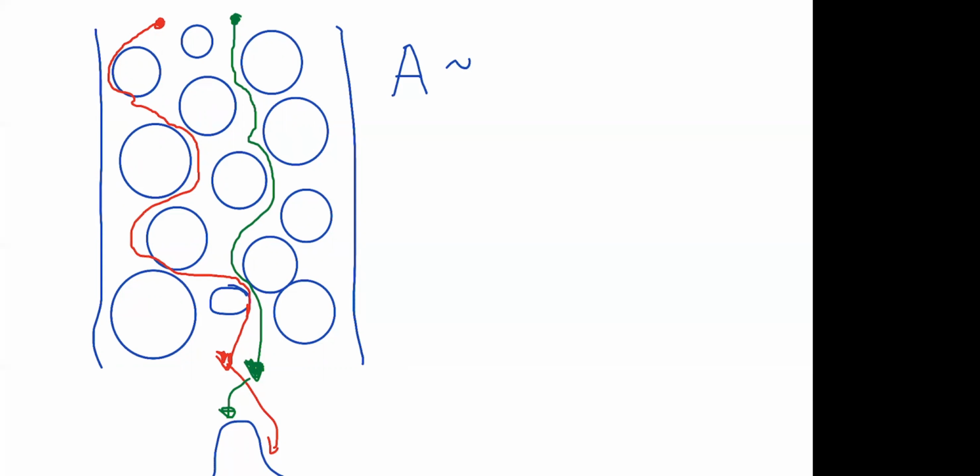Of course, it's easier to pack the column if the particles are very similar to each other. And the more round they are, the better it is. So the particle shape is very important. But it is also the diameter of the particle that is very important.